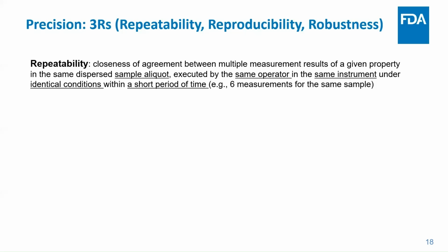What you typically see is that during one measurement, we get multiple observations of that measurement, which we call measurements in the instrument protocols. So what does repeatability tell you? If something changed, say one measurement differs from another, there is a difference. Ideally, they should be the same, or really, really close. But in case there is a difference, what does it tell you?